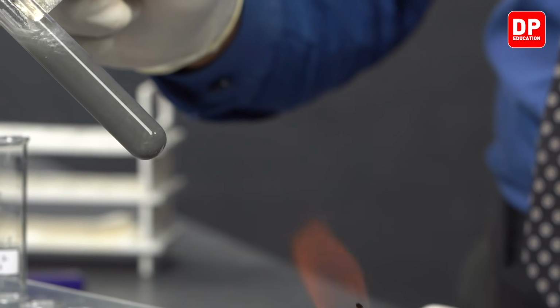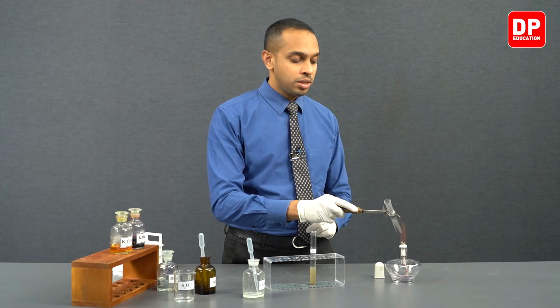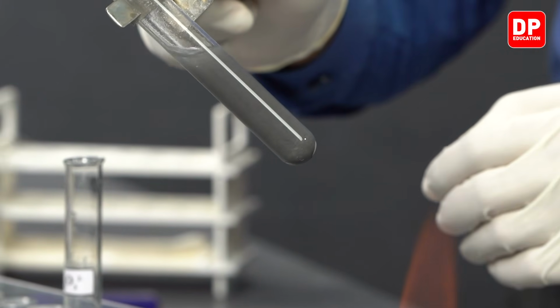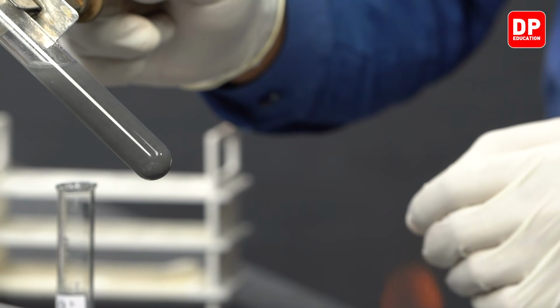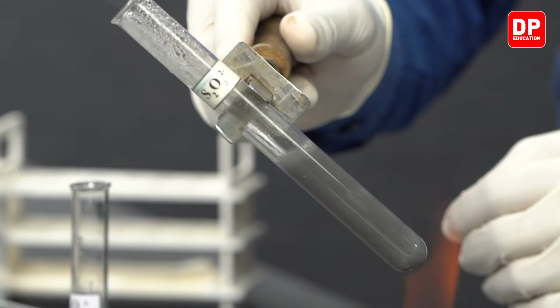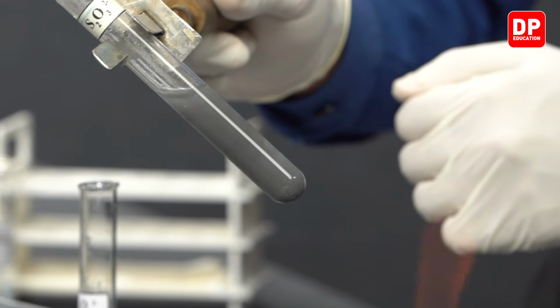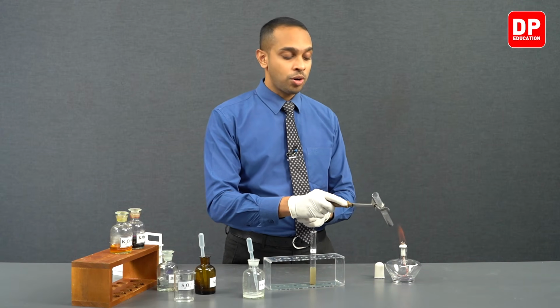When you are heating these solutions, be careful to not let the solution boil over. You have to keep heating it and taking it away from the heat, otherwise it will boil over and come out of the test tube, or you will see the solution get splashed out of the test tube.